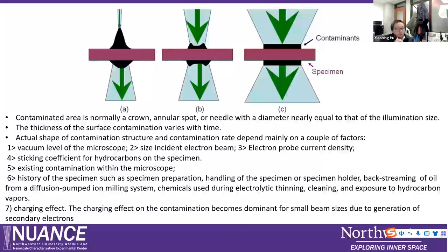It may also be related to back streaming of oil from a diffusion pump, the vacuum system. I will show you this later. Also, for example, some users use electrolytic thinning, and there are residual chemicals on the sample surface. Also, if you leave your sample in the air for a long time, several days, there are many contaminants in the air, and hydrocarbon will be deposited on your sample.